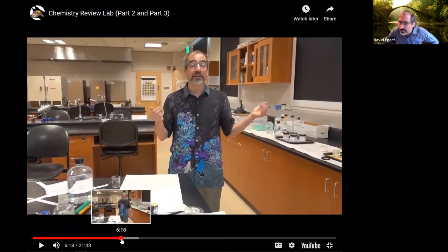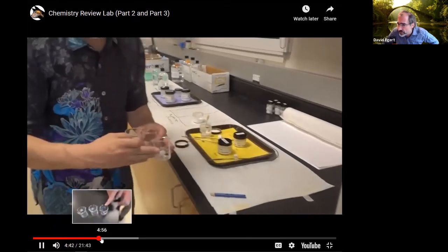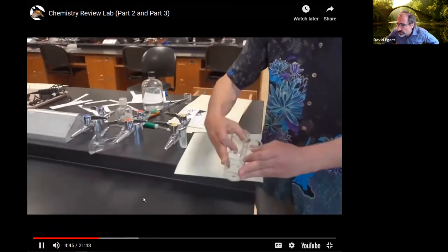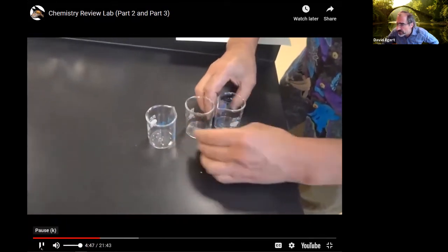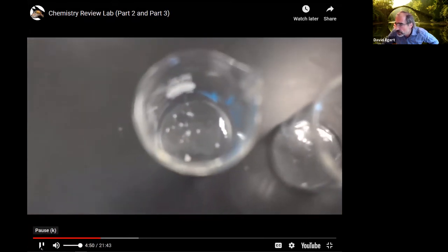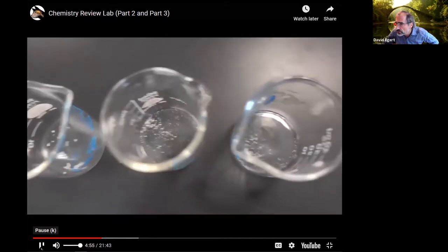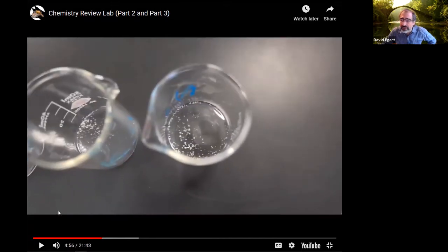I should mention, obviously for this, you're not actually looking at it, but if you go back, we have a black background where I think it's going to be easier to see. Right, you can pause this thing. And right, so in each case, hopefully you'll be able to see there's these little white crystals at the base of each of them. Right, so you can go back and describe what it looks like.